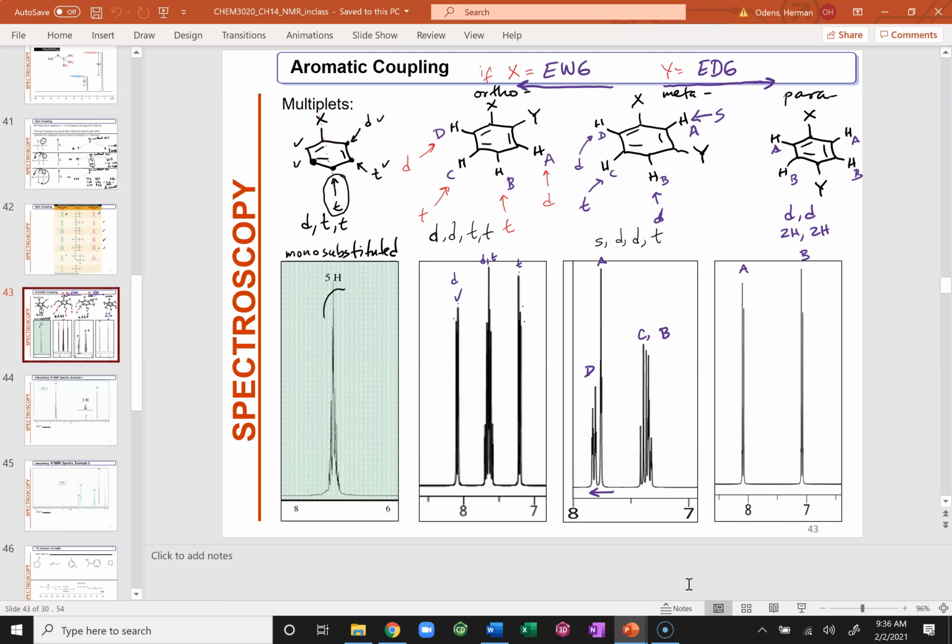All right, so now I'm going to teach you something new, and then we're going to start analyzing spectra. We're going to do that until 10:40, so we'll have time. Before we do that, I'm going to teach you now how to identify the W coupling, which is very important in proton NMR, and then we'll do carbon NMR, and then we'll do some unknown practices. All right, check this out.